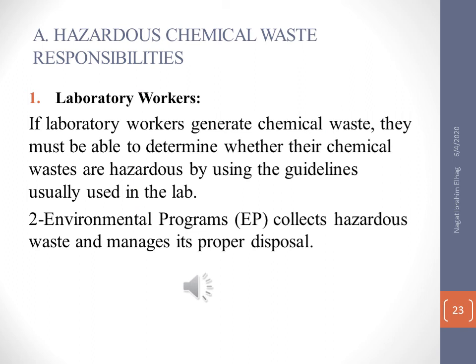One of those hazards is waste. Each chemical lab has waste, and it has a responsibility to discharge this waste. You have to contact the environmental program to help you choose the suitable cans for each waste, to ensure that the waste will not make contamination in the environment.